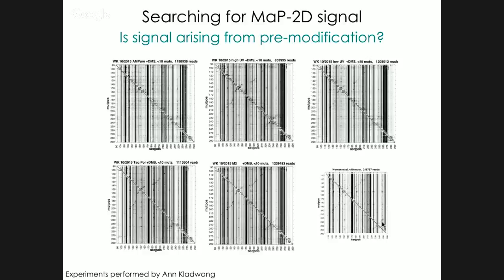So carrying on from this experiment, I was progressively developing an analysis software for our lab, which was separate from the Weeks lab software because parts of it were missing. So we couldn't carry out their exact analysis.